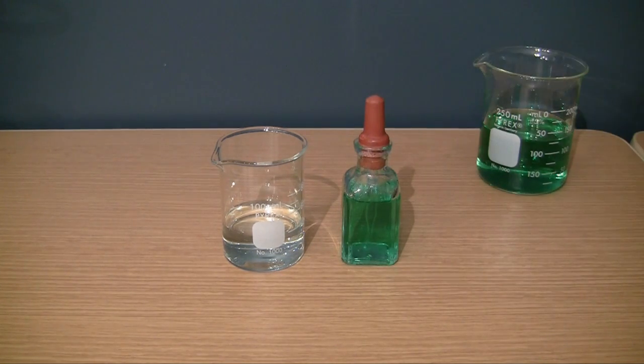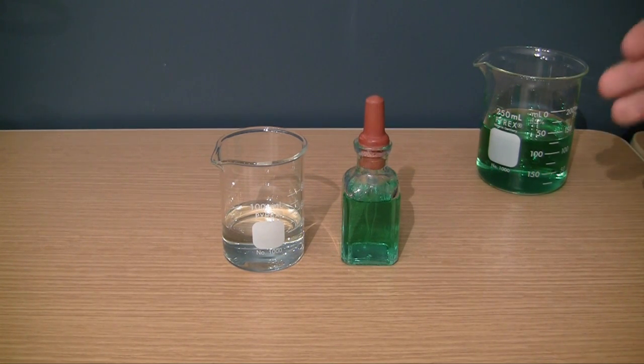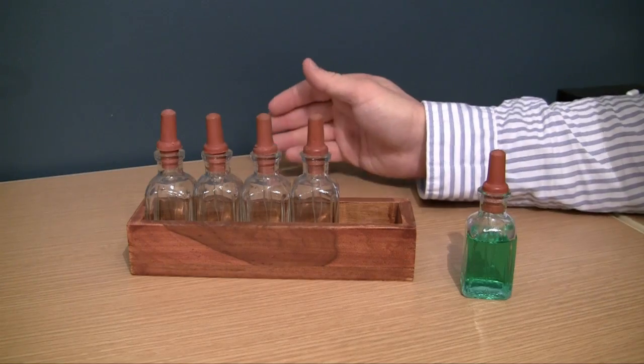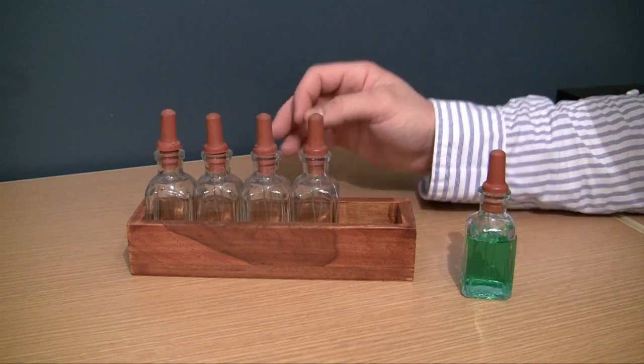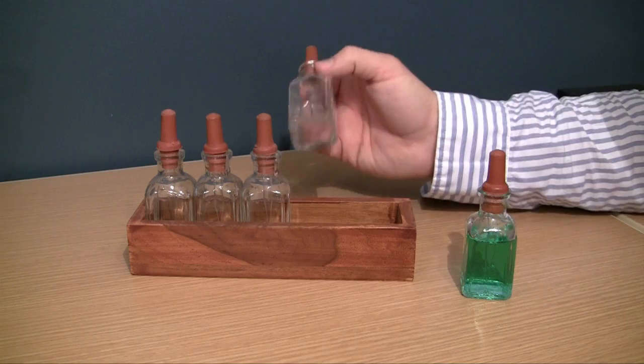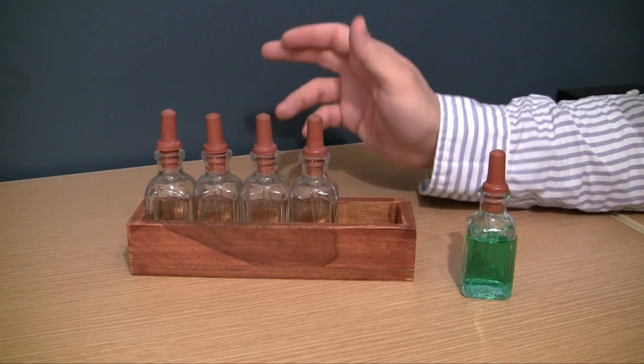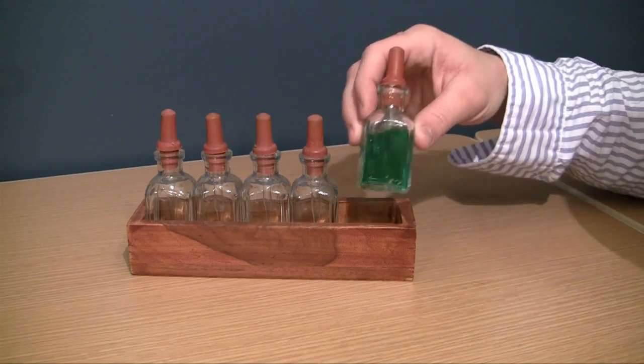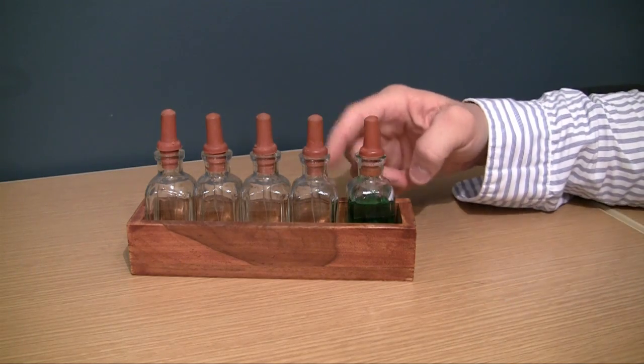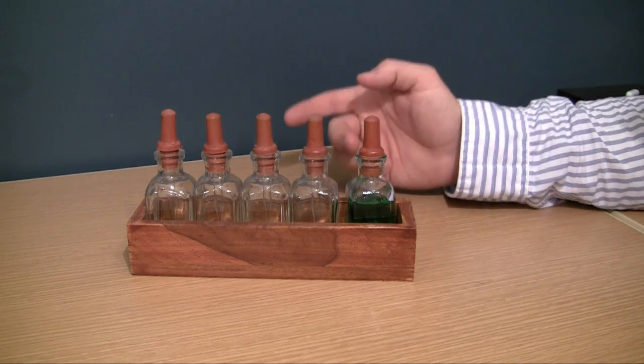So that's basically the basics of a Barnes bottle, aka a dropping bottle. Now you're going to find that whenever you're shopping for Barnes bottles you usually just can't buy one or two. They usually come in a set of either five or ten or sometimes a dozen. This set right here came with all the bottles and the rack and I think it was $12 plus shipping.